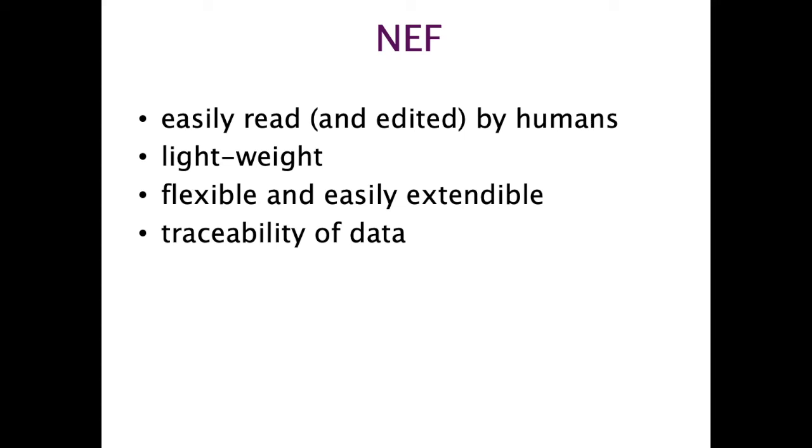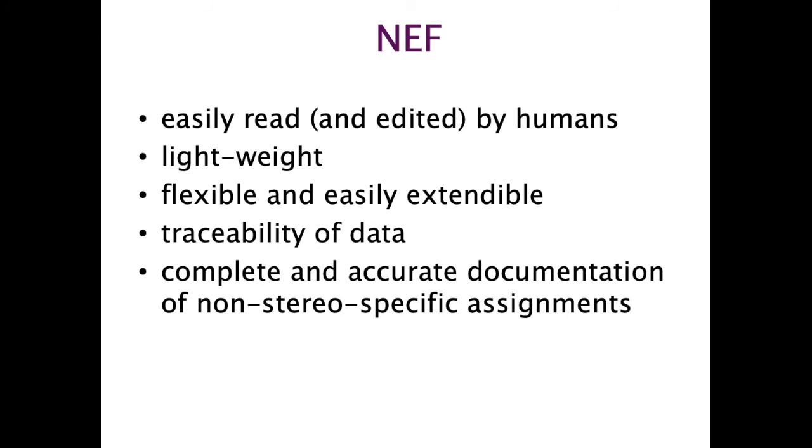So as you're going through different rounds of structure calculations, if you're using different programs to do structure calculations, and then going on to do your validation, that peak will always remain peak 1327, and you can trace that throughout.